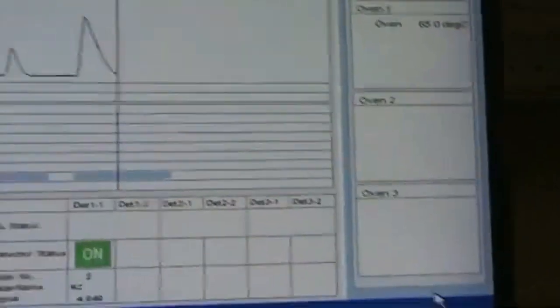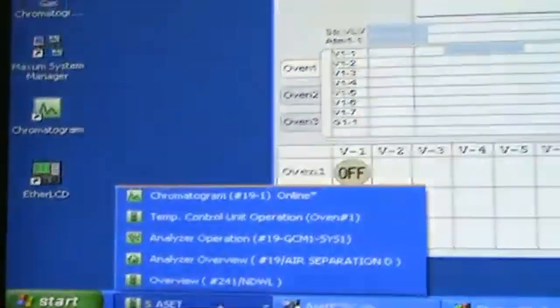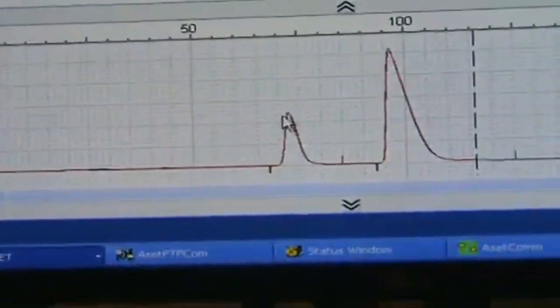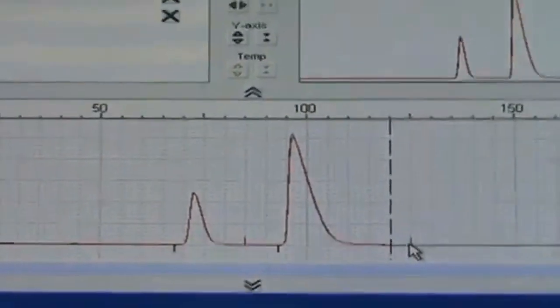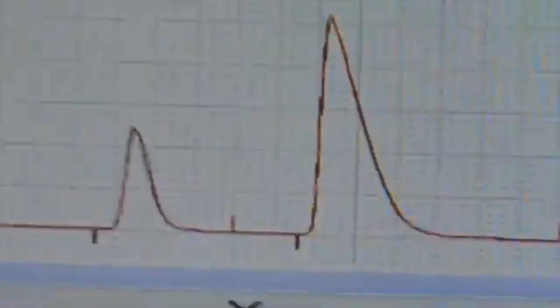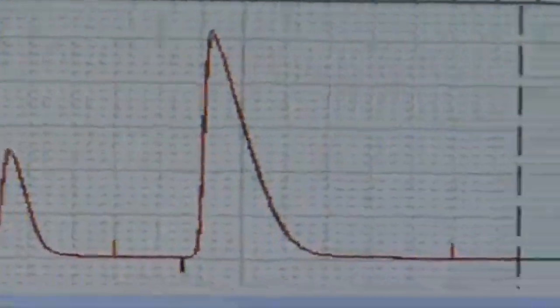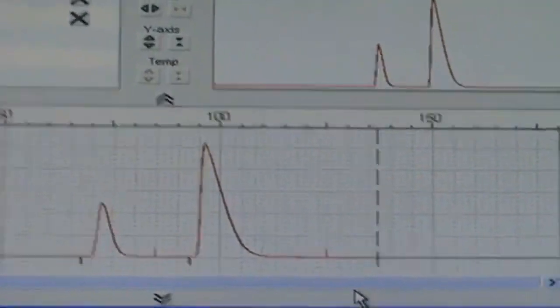And exit. And then we'll go back up here and let's find our chromatogram. And you see how it's drawing a line over? So it's repeating, like perfectly repeating. And gates are exactly where they were before. We are absolutely drawing lines over lines, so it's absolutely repeating.